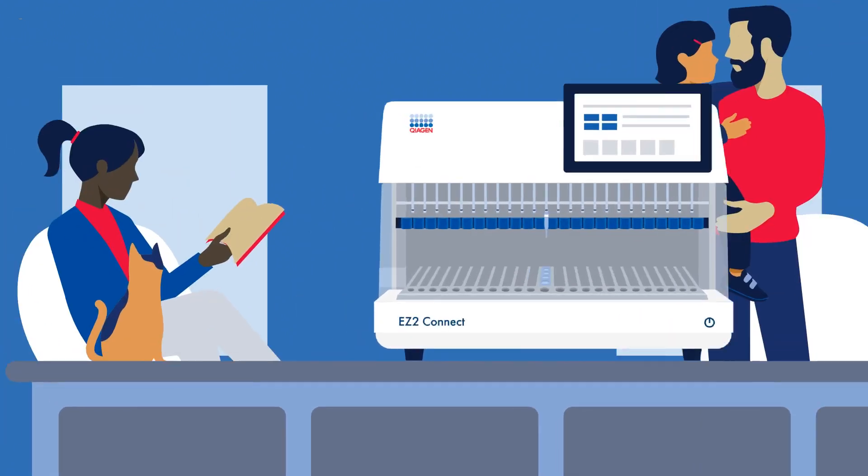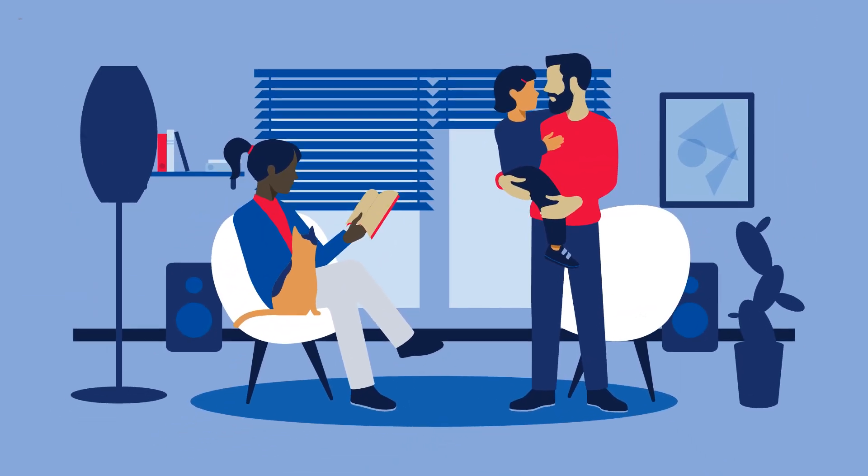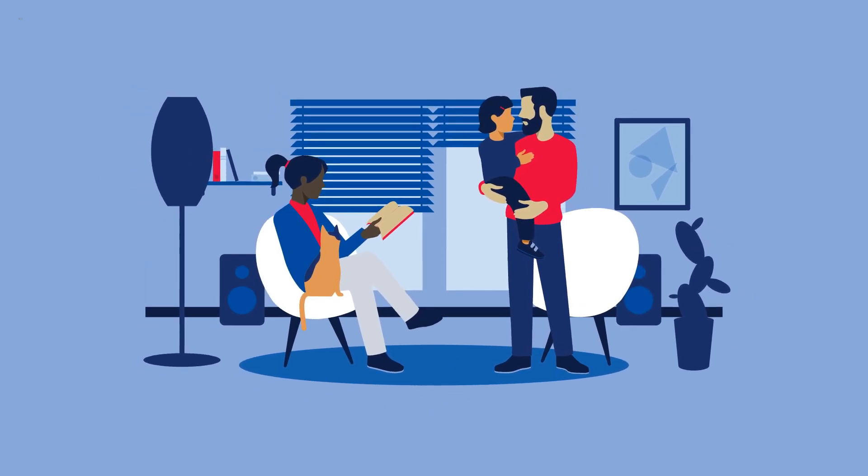Enjoy safer and standardized protocols, reproducible results, and a greater level of automation with Easy2Connect. And make your evenings your own. QIAGEN.